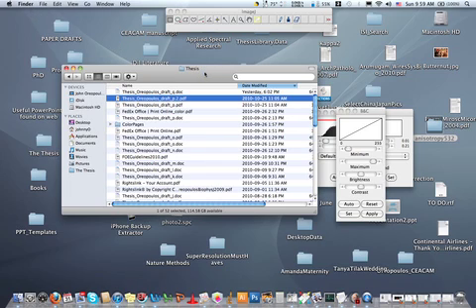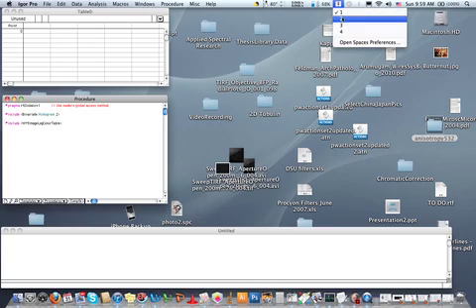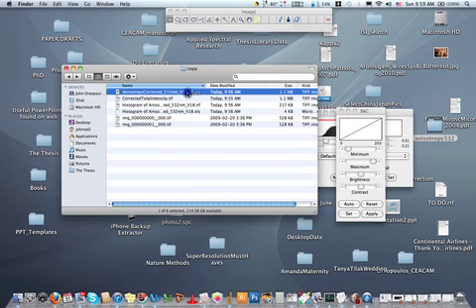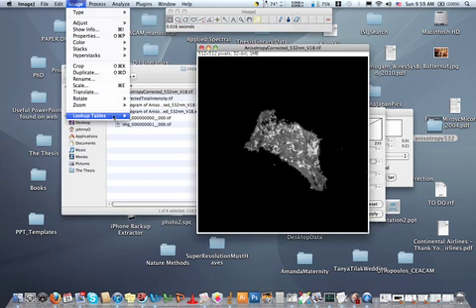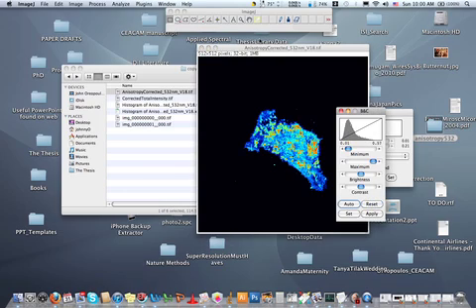Right, so what's next? Now we want to open up Igor Pro. Sorry, no, we want to go back there. There's one other thing I need to do. We need to take the data which is in the image and convert that into a format that Igor Pro can read. So that means I need to take the pixel data and transform it into a column of data, basically. So let me just open these up again. And there's our anisotropy image, which I always like to view in the Royal lookup table. And just reset that there.